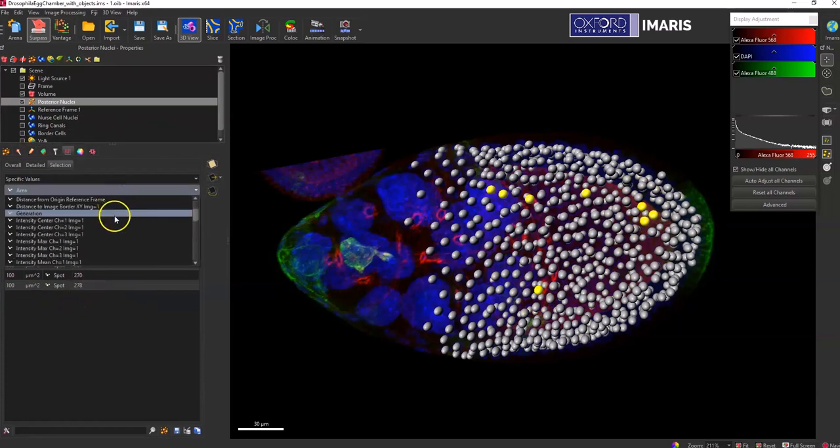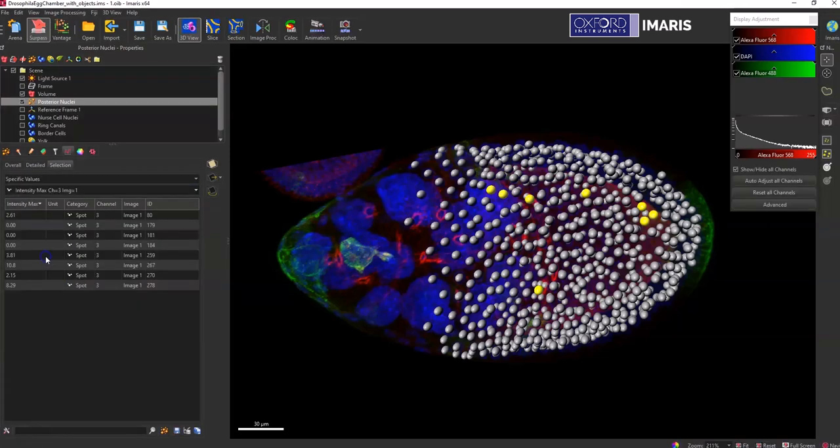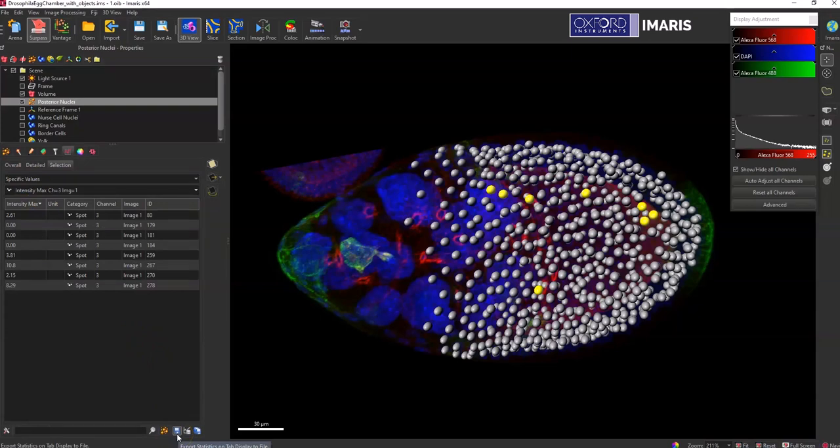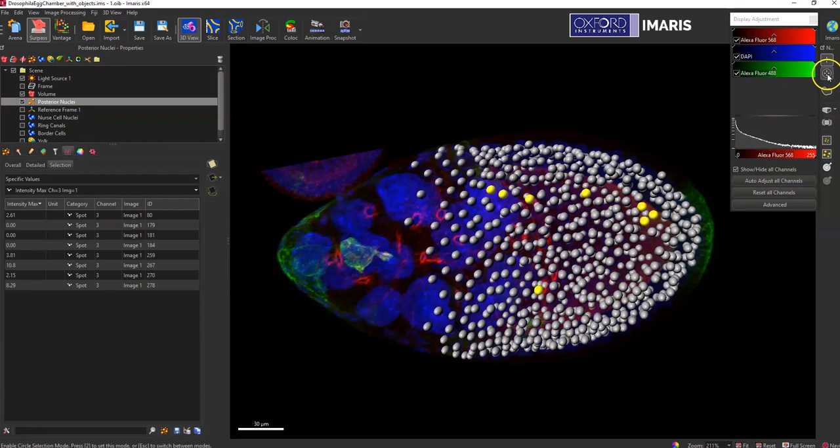And then if I want to go back to that statistic I'm interested in, the max intensity of channel three, I can switch to that one. And then by selecting this single disk icon, I can export just the subpopulation or the selection of objects that I'm looking at. So that's using the pointer method.